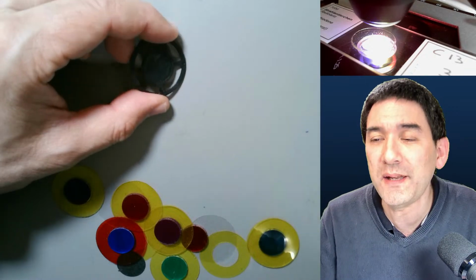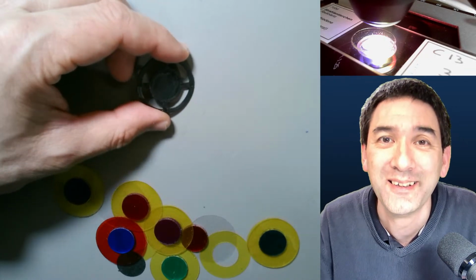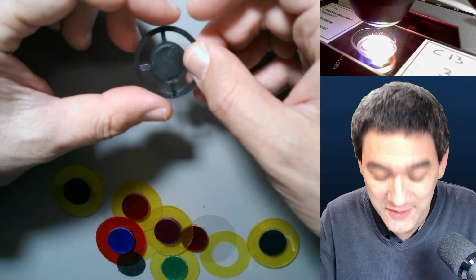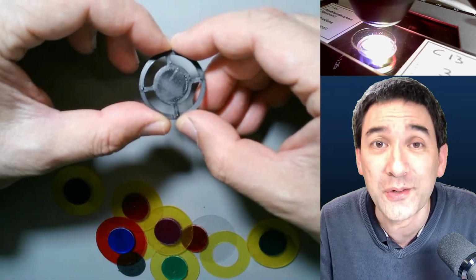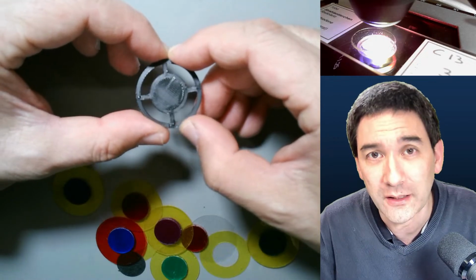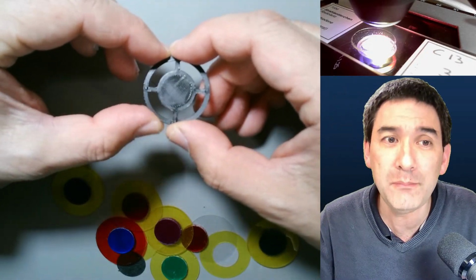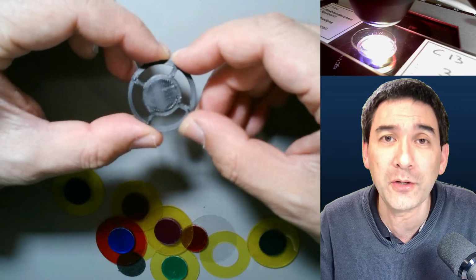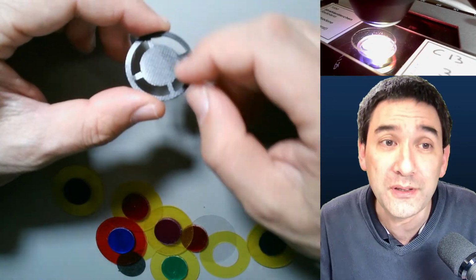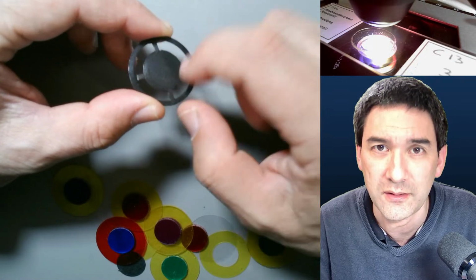How do you choose the best diameter of this middle part? That's a thing that has caused me quite a bit of headache. Short answer: experimentation. If you check my other channel called Microbehunter Microscopy, I made a few videos about making and 3D printing those filters. You don't have to 3D print those, but it was simply easier to make it like this.